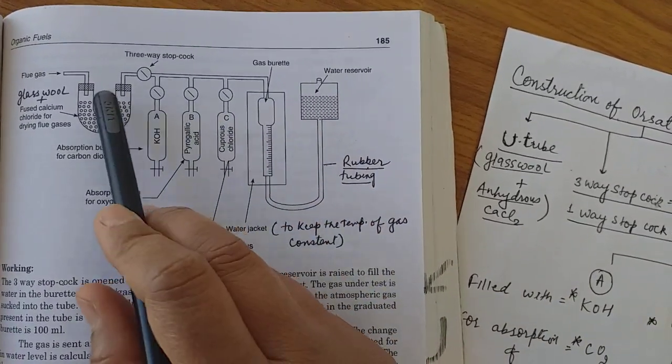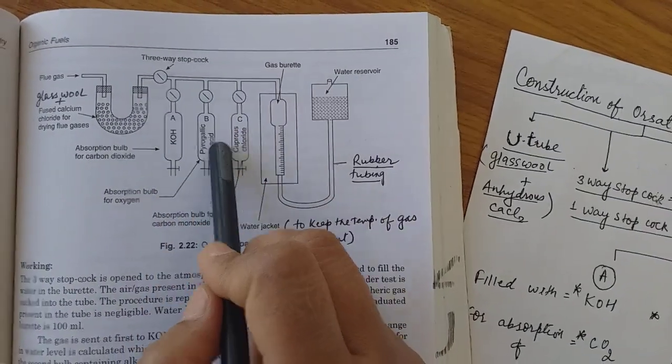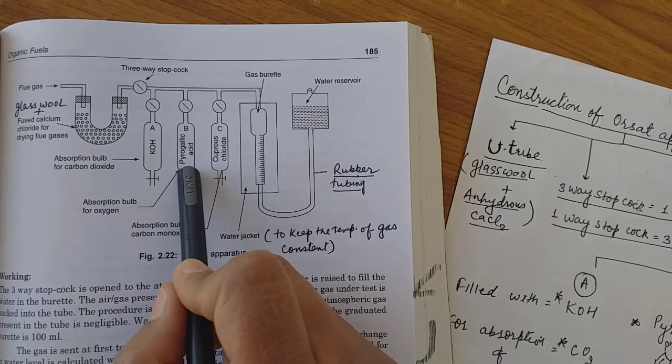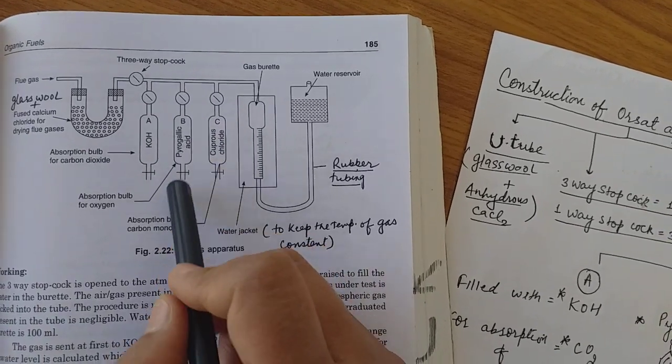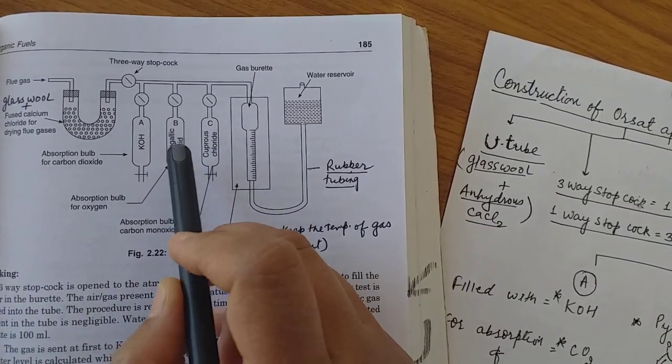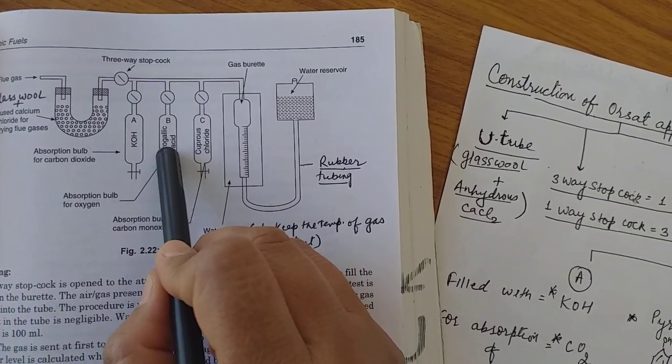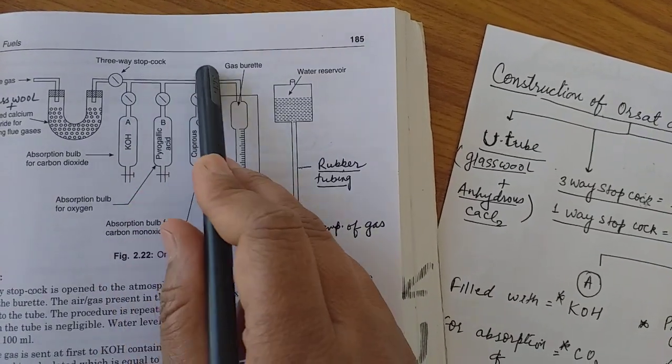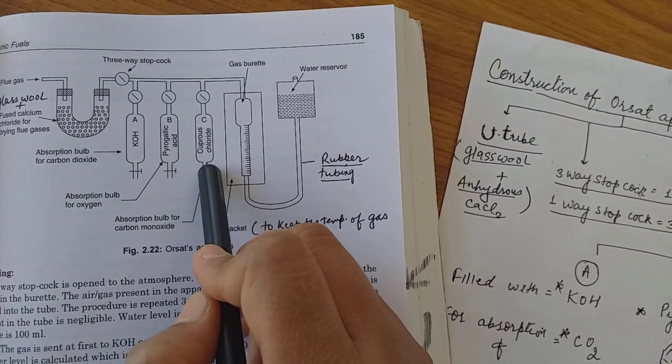After that, the gas is coming to the second bulb which contains pyrogallic acid, also called 1,2,3-trihydroxybenzene. It absorbs the oxygen. After absorption of oxygen, there is again decrease in the pressure here. The water level also decreases.